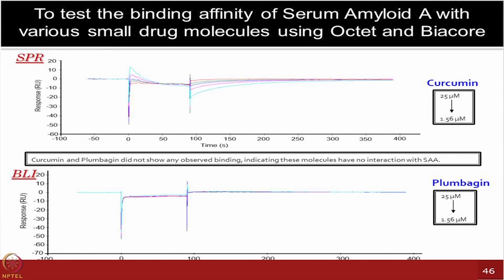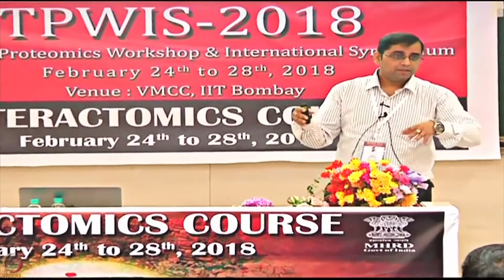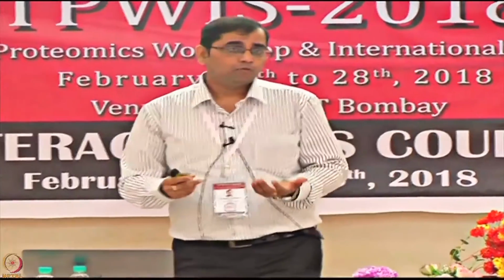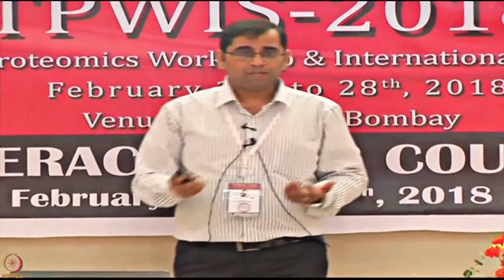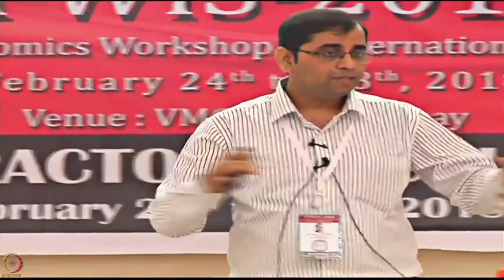So what I want to convey to you is that many times, don't just rush for one technology platform. Think about, if you have to test many compounds, what the cost can be, and what the variations of doing those experiments can be. Start using those platforms which can narrow down your leads and hits, then do the final experiments on something which is really acceptable. And of course, if you have a huge amount of funds available for the project, then you can do everything on the same platform. But otherwise, you can mix and match and choose which technologies can give you what.